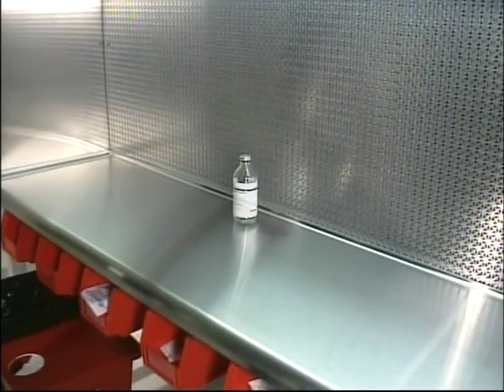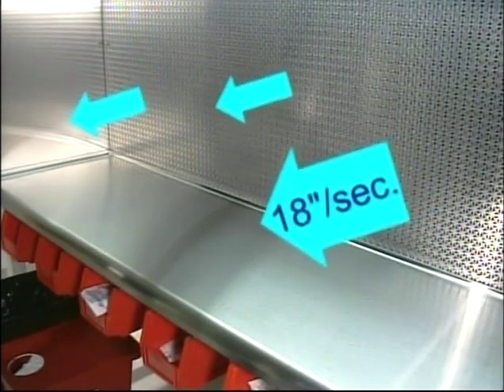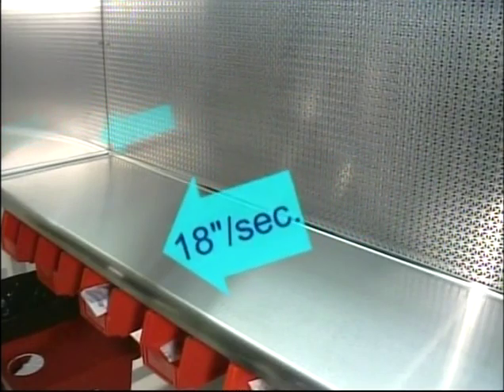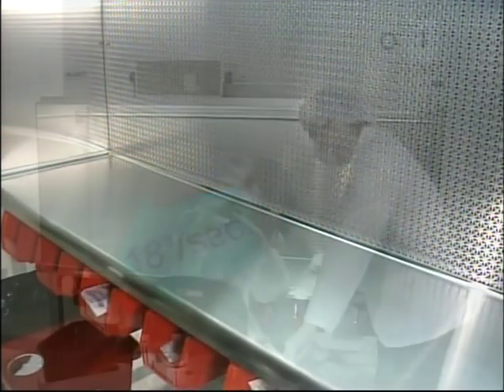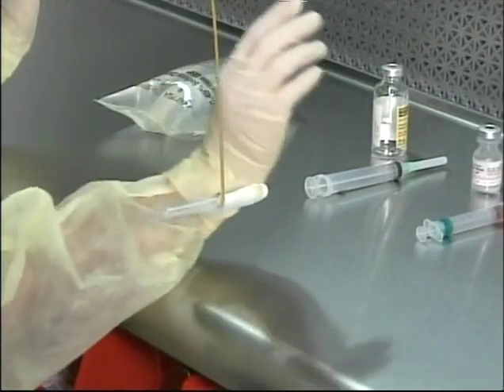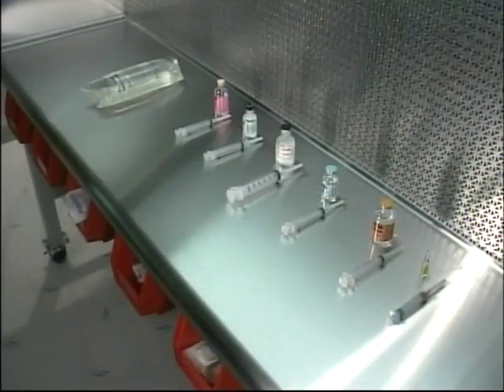Another important characteristic of the HEPA filter is the relatively low speed of air movement. Air exiting the opening of an LFCB is easily disrupted by erratic movements close to the hood, by talking or laughing at the hood, by room ventilation systems, and by rapid hand movements within the work zone. Remember, all critical sites and pathways must be maintained in the flow of first air.